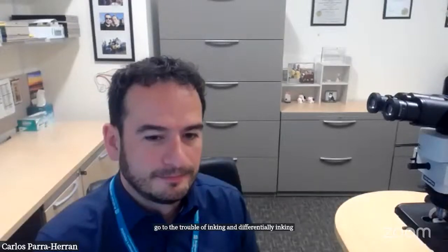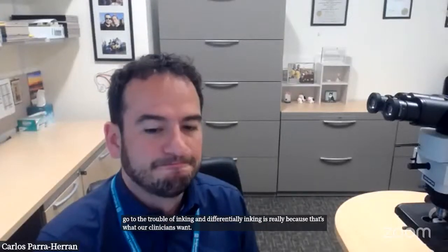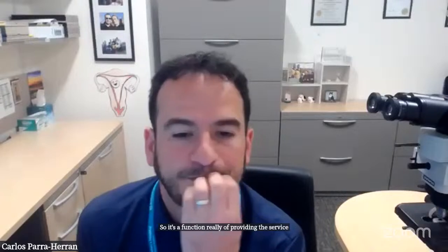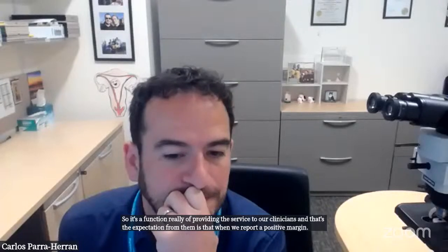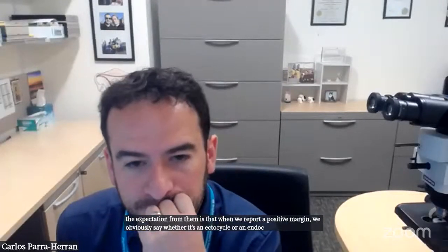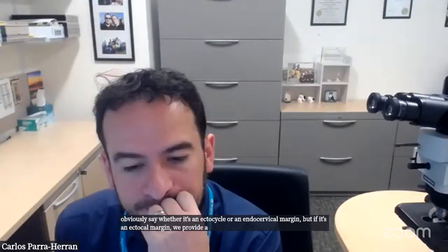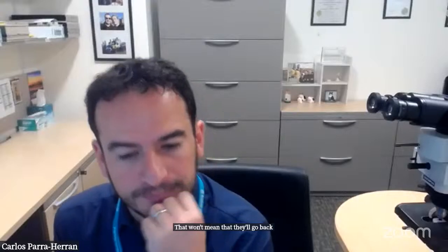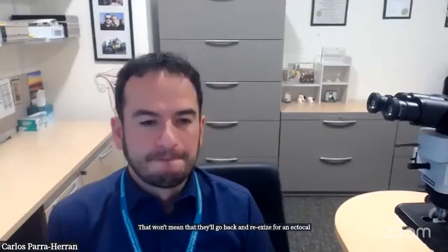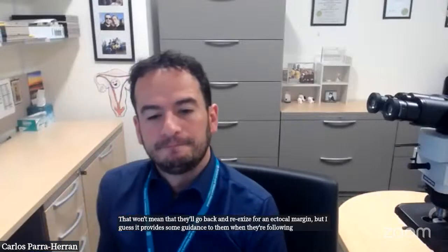Yeah, well, first of all, the reason that we go to the trouble of inking and differentially inking is really because that's what our clinicians want. So it's a function of providing the service to our clinicians. When we report a positive margin, we obviously say whether it's an ectocervical or an endocervical margin, but if it's an ectocervical margin, we provide a clock face orientation of where that point of involvement is. That won't mean that they'll go back and re-excise for an ectocervical margin, but I guess it provides some guidance to them when they're following the patient colposcopically.